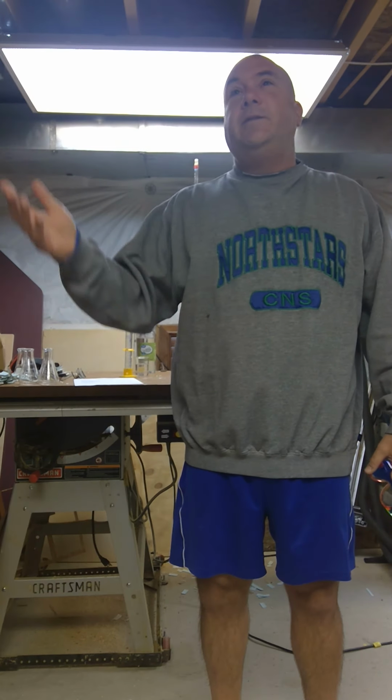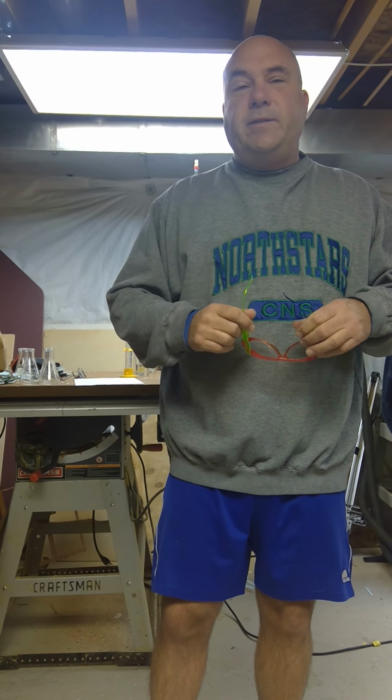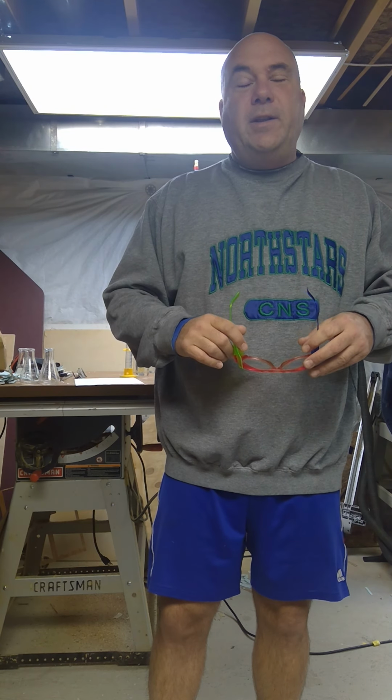Okay, so this is where I do all my recordings in the morning. Today we are going to work on a lab called the titration of vinegar. Now, some of you may have done a similar lab to this when you were in your regular chemistry class. This one, the calculations are much different. So we're going to give this lab a shot.